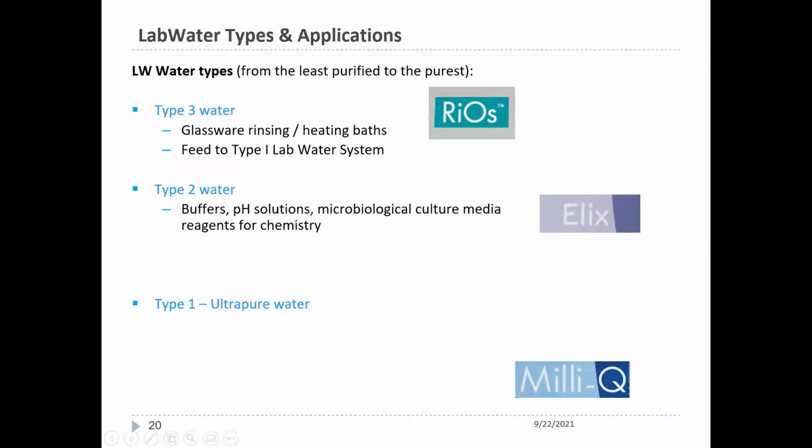Then we look at type 2: buffer, pH solution, anything you can think of in the lab, weather chambers feed, autoclave filling, and then also this can feed the type 1 water system.